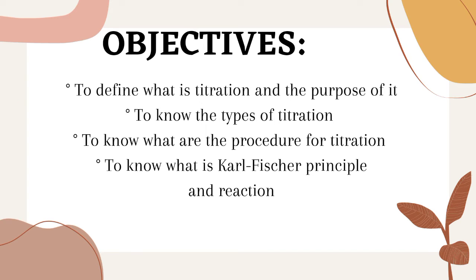So my objectives are to define what titration is and the purpose of it, to know the types of titration, to know the procedure for titration, and to know the Karl Fischer principle and reaction.